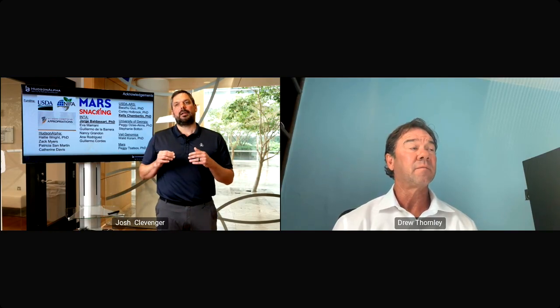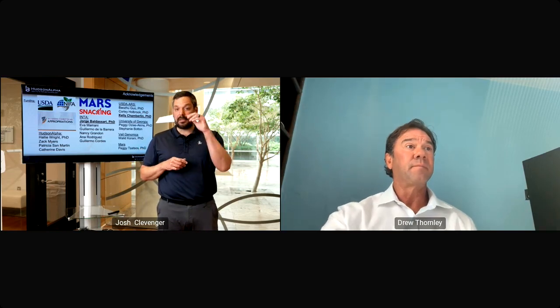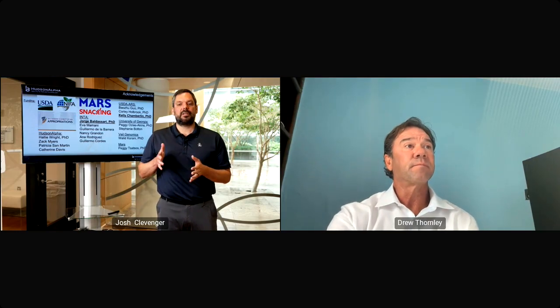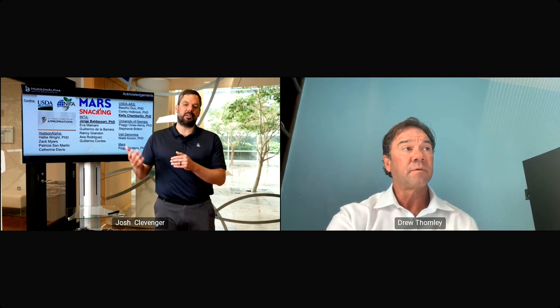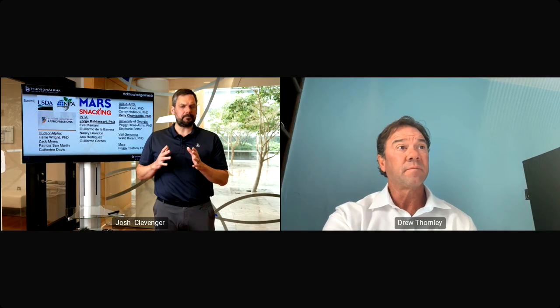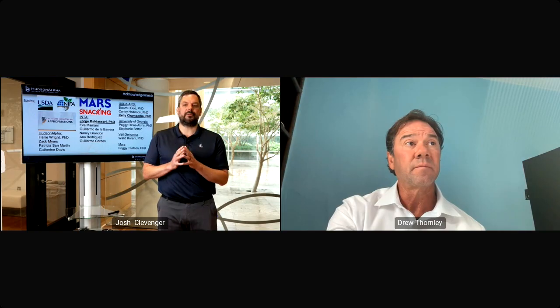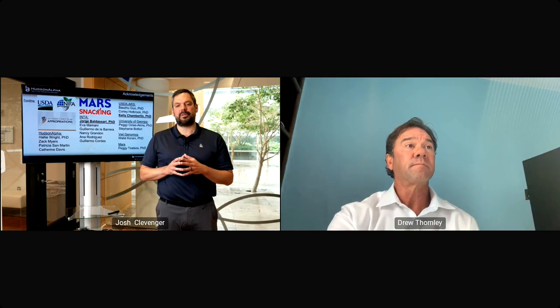In some cases, we will use TaqMan for individual markers to validate if we want to do that and just make sure. What I didn't go into today is the ability to use enrichment panels, which I'd mentioned before. Most of our breeding operation and the folks that we work with where we're doing large scale selections for them, we use custom enrichment panels, which you can order either from Twist Bioscience or from IDT or others that would produce oligos.